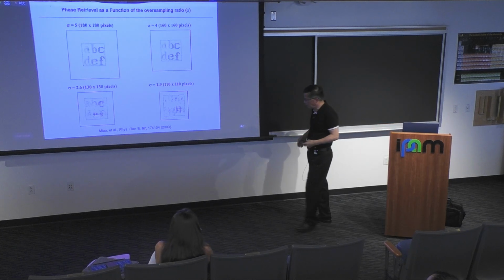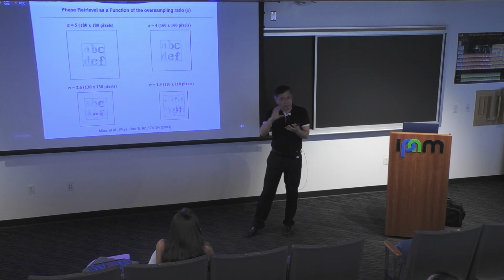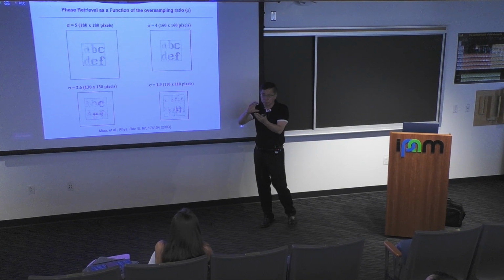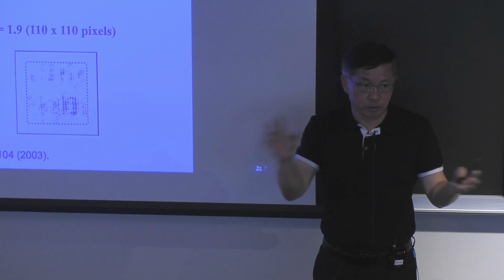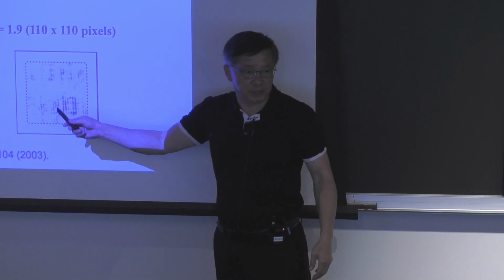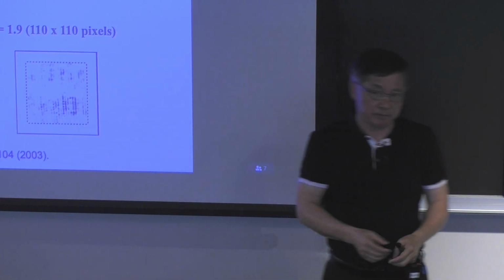I will also talk about ptychography. Ptychography uses overlap, so basically the concept is that the independent measurements outnumber the unknown variables. With other techniques, you can use overlap, and then you can look at an extended object. You don't need 0 outside. But for these pictures, I mean a finite object. You can use either a finite object or a finite beam.